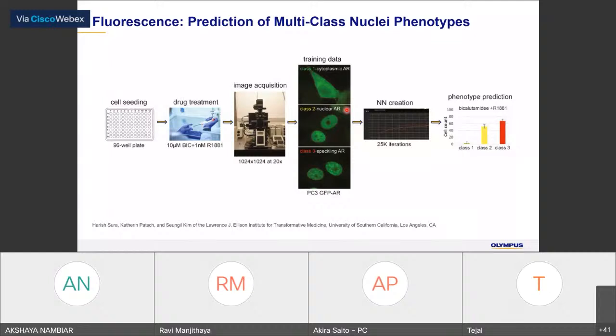And if you give some kind of ground truth, which cell line is this one and which cell line is this one, and create a neural network, then it might be possible. But I'm not sure how different those two cells are in your co-culture. So I cannot guarantee it will work or not, but I think it's good to try with the neural network segmentation.